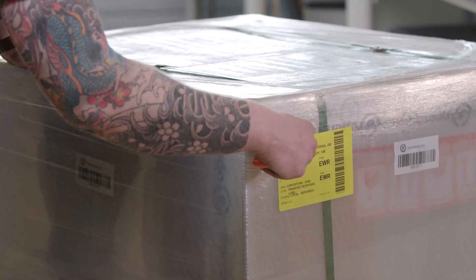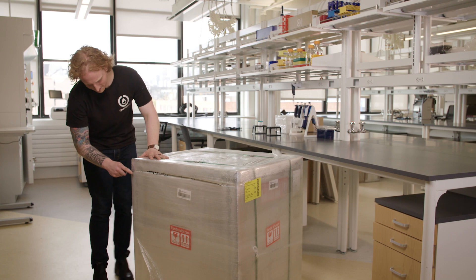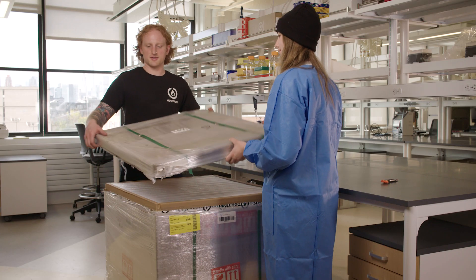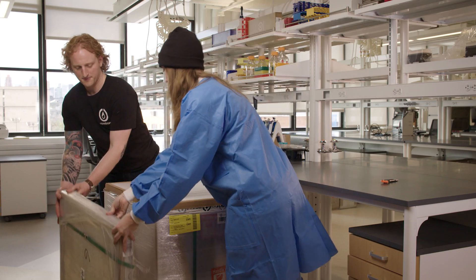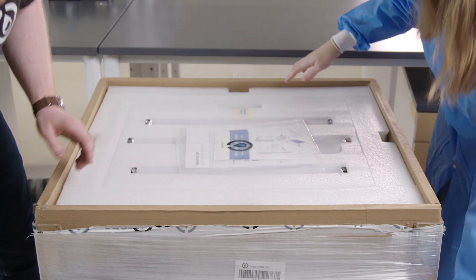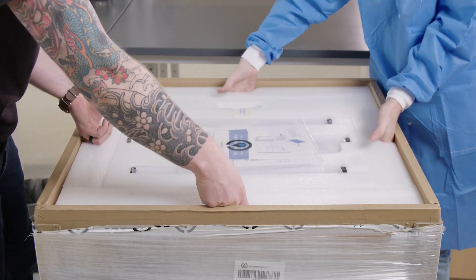The first thing I need to do is take the box cutters and cut along the top of the box and then lift the lid off the box. Now that the box is open, there is a thin layer of foam above a thicker layer of foam that houses the top panel and the side panels.